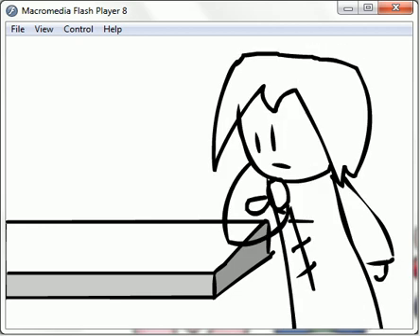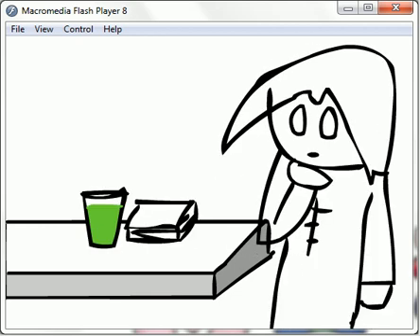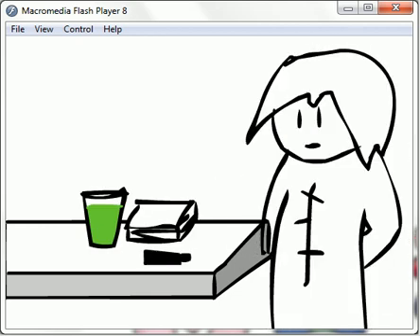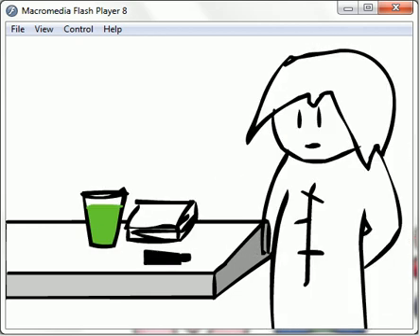Sorry, Ken. Let me give you your materials. Alright, so now you have to perform paper chromatography.